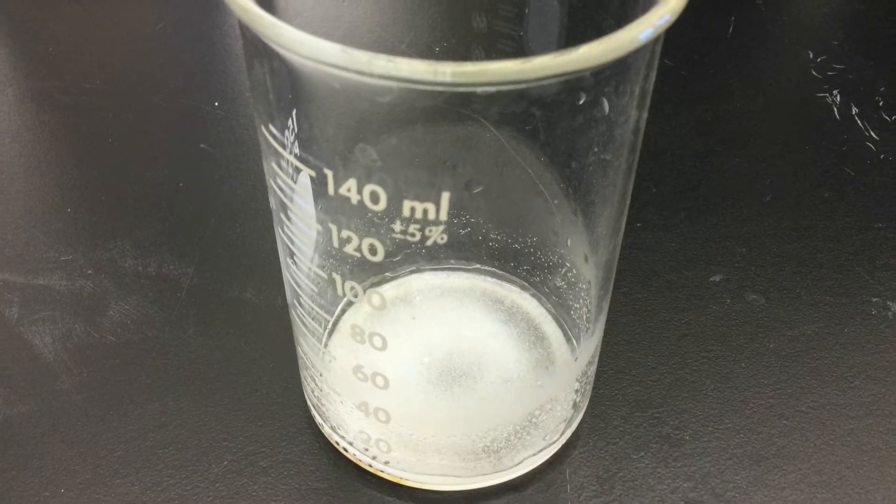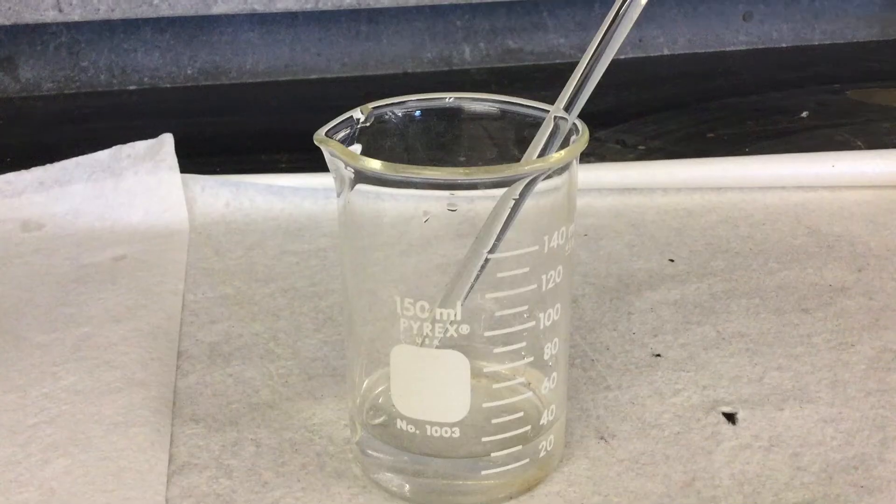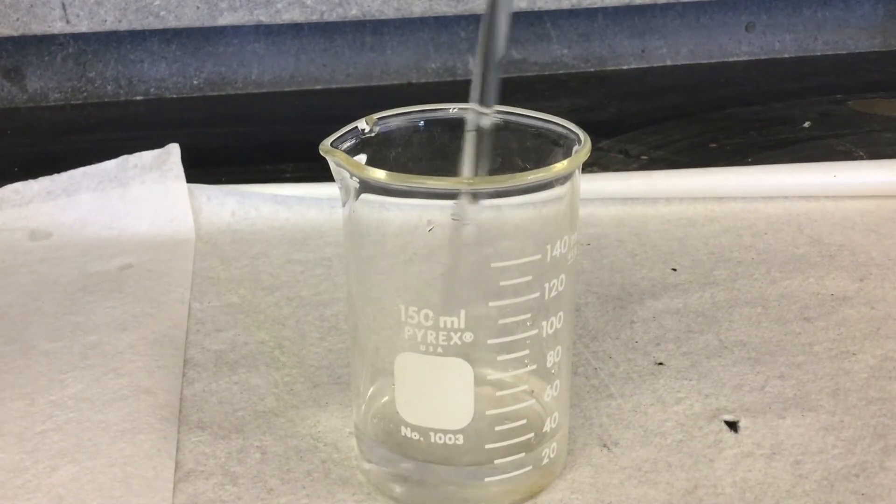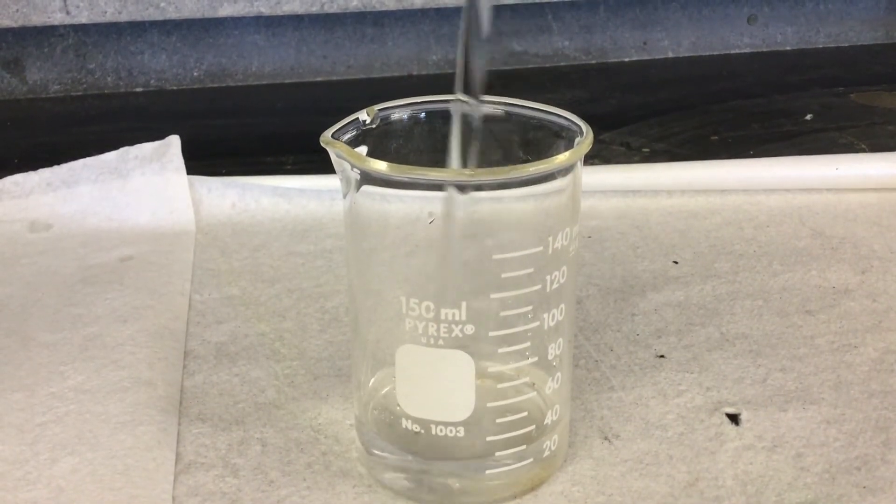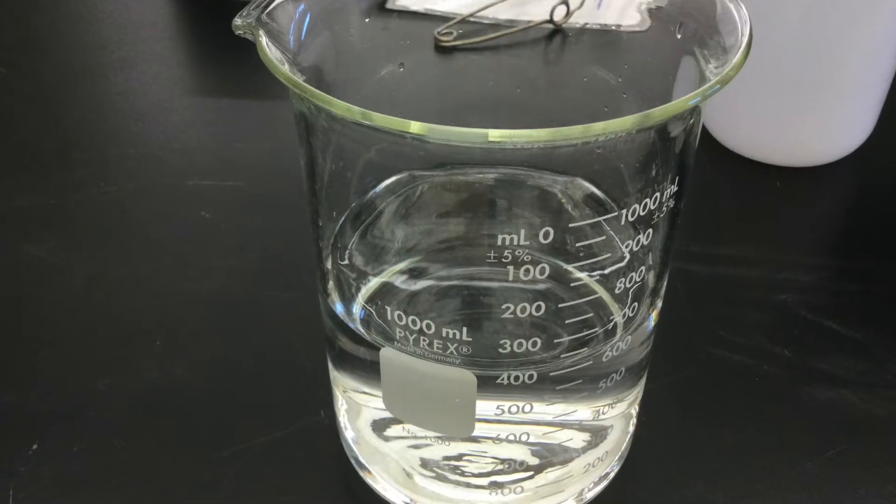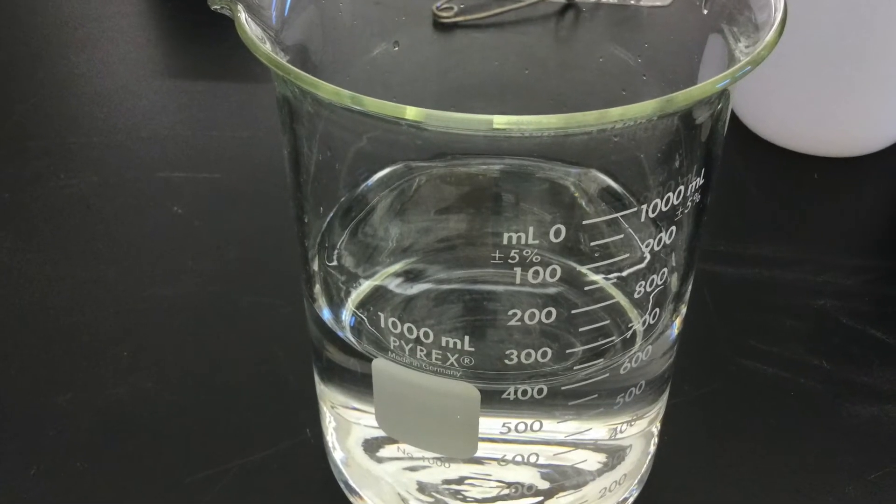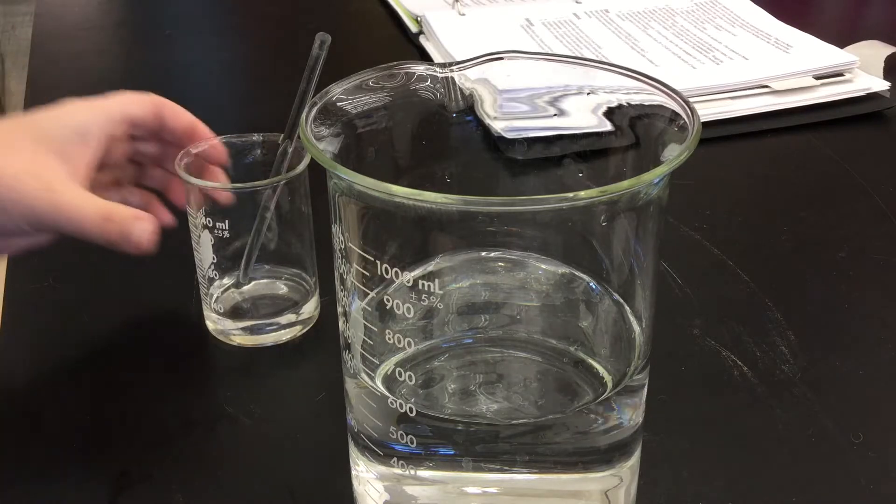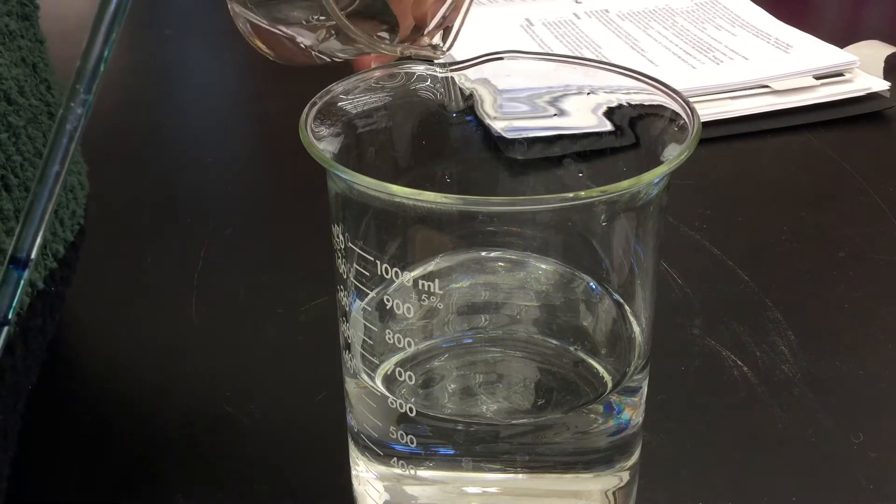Begin by preparing the sulfurous acid. You're going to need to weigh out 1 gram of sodium sulfite and add it to a small amount of concentrated hydrochloric acid.